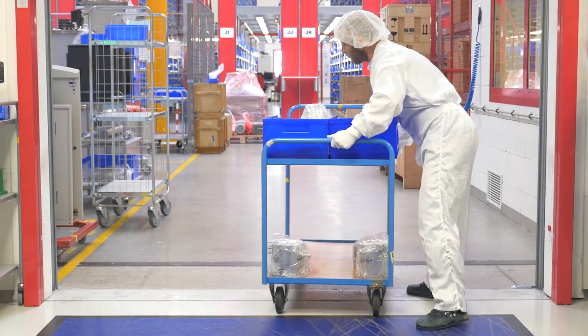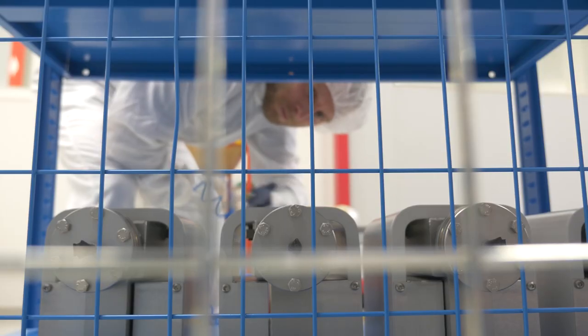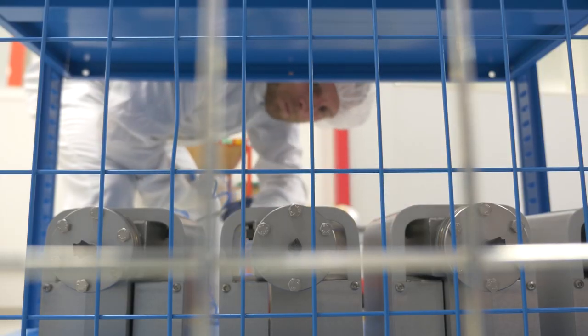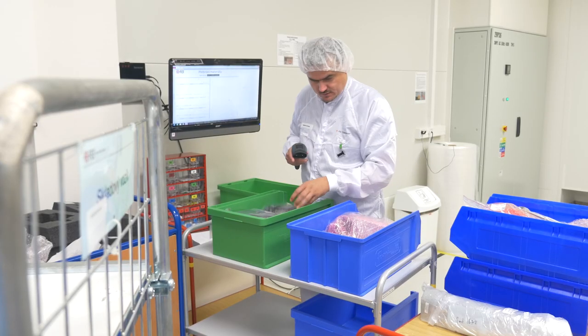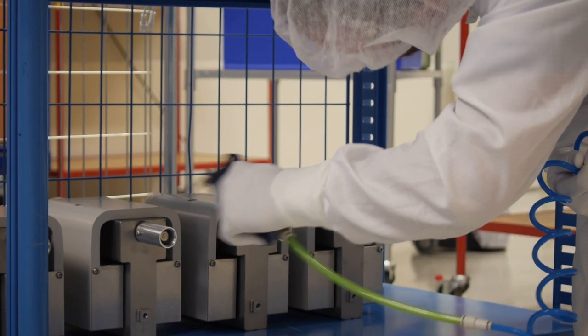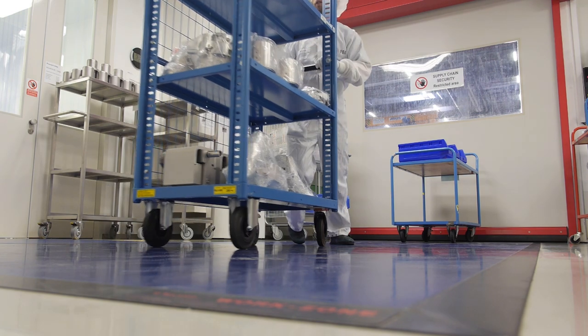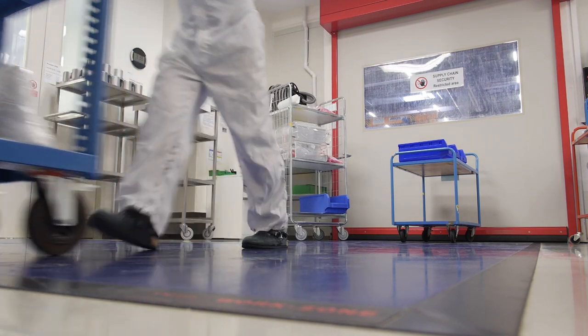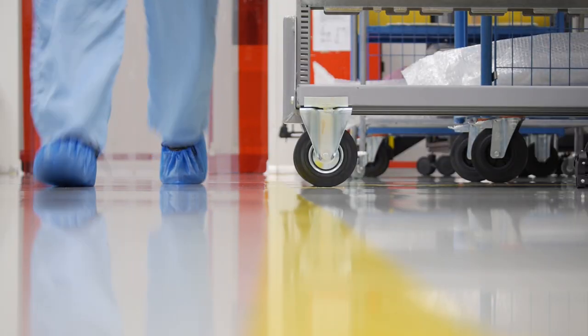The material from the warehouse enters FEI Productions through here. Not a single speck of dust can get inside. I know. One particle of dust could devalue the entire microscope. Maybe not the entire microscope, but certainly one of the parts. And when you consider that the price of one part is often tens of thousands of dollars, you suddenly realize that the value of the material on the cart in front of you is that of several new cars.